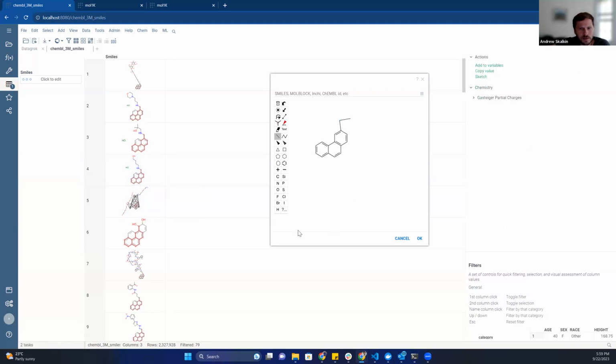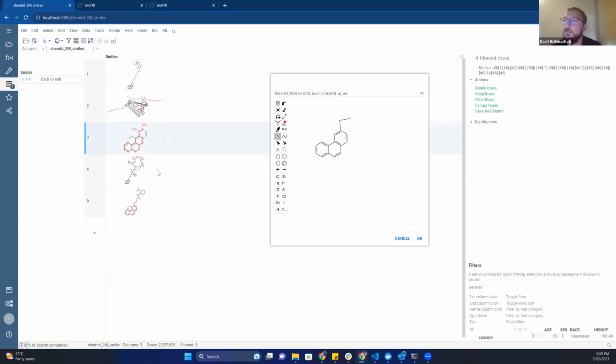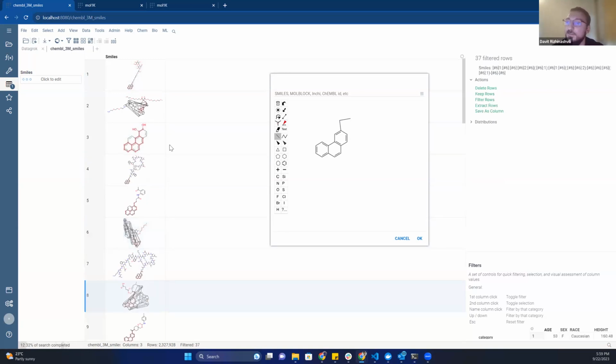Oh, this is nice. Yeah, you can see this addition and elongation of the data set here, that the new results are just added down. And I should mention, there is no flickering effect. It just continues. The new rows are going to be added at the bottom at their corresponding place.